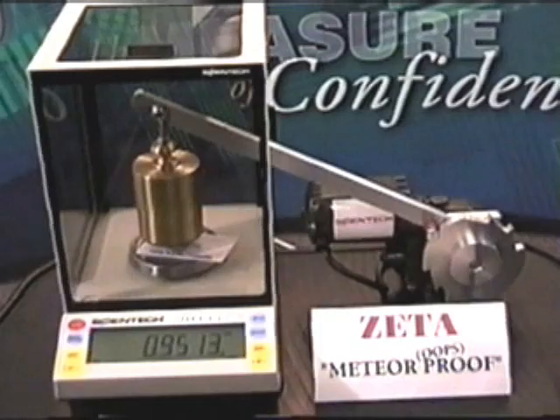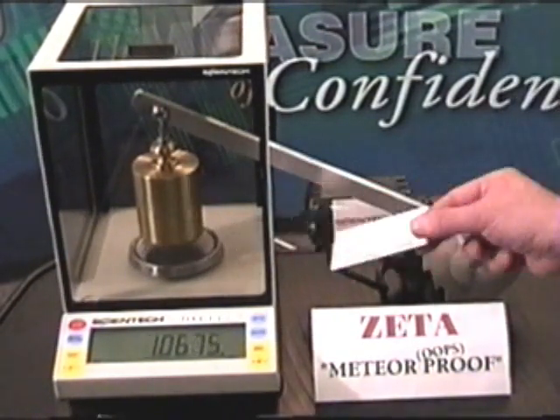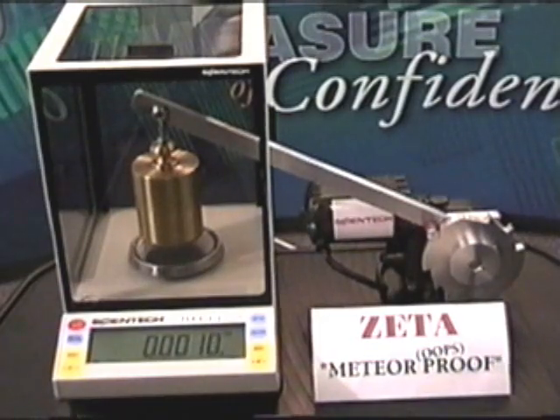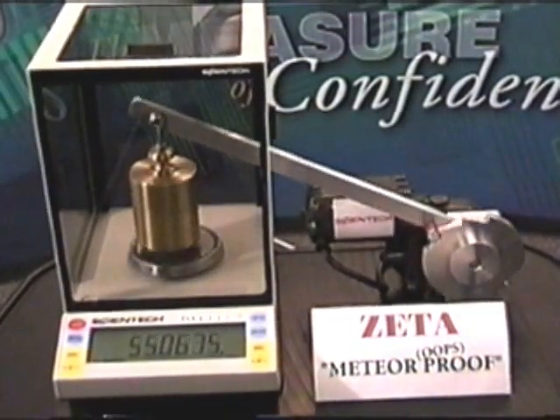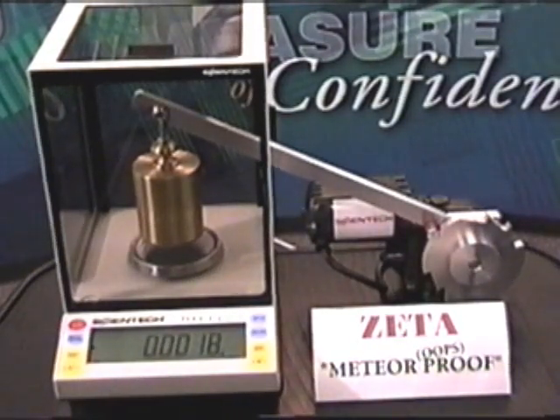So we can see that it repeats — it's not broken. This test would break any other analytical balance in the world except the Zeta series.